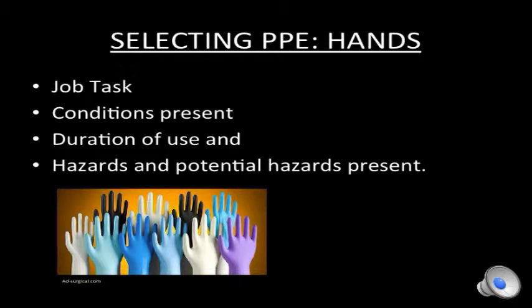Consider how long you plan to wear the PPE. A longer duration may require a thicker glove, or a changing of gloves due to the permeation rate of the chemical through the selected glove. And finally, consider all of the hazards and potential hazards that are present.